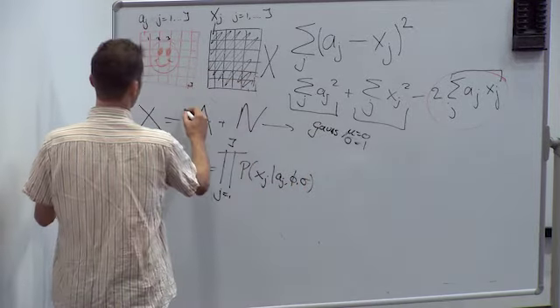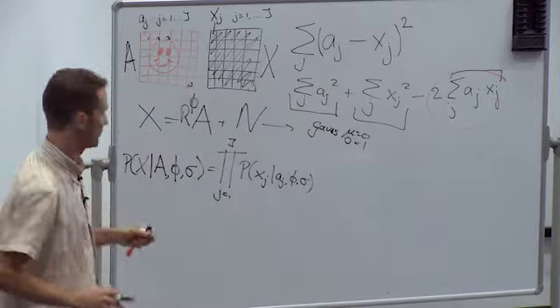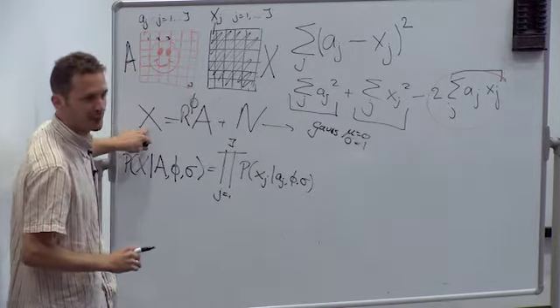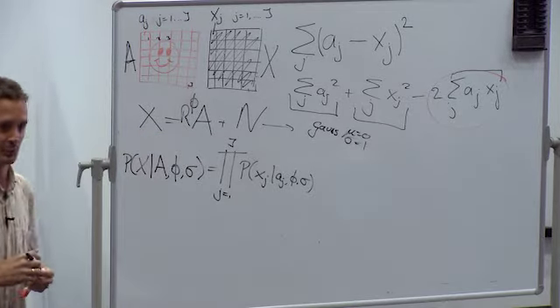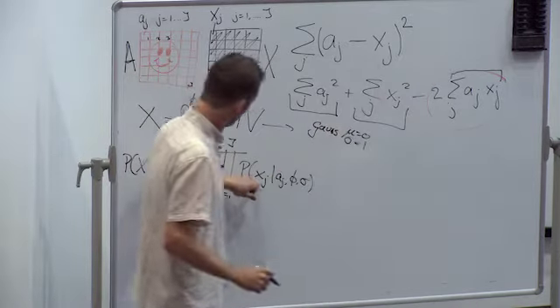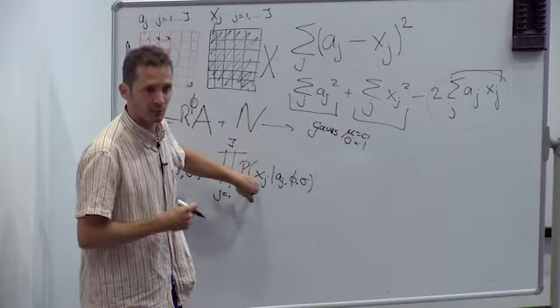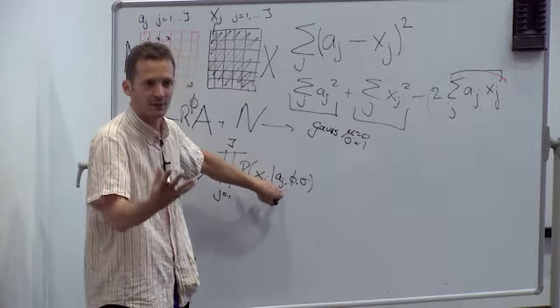The rotation could be a rotation matrix. The experimental images are all rotated versions of the penguin, and we don't know that rotation phi.